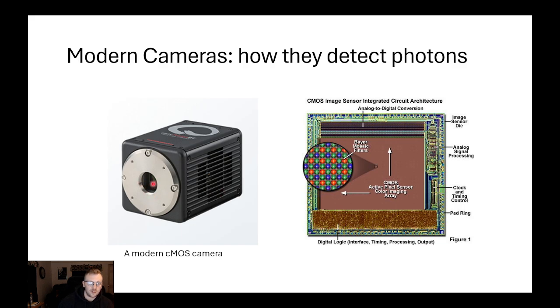So behind this opening, we have a chip. If we go over here to this cutout, this is an image representing what the chip's architecture is. There's a lot of this here that you don't need to care about. That is a computer engineering thing that we don't need to understand. You have sensors and analog signal processors, and all this stuff is designed to talk to a computer. We don't particularly care about that. We care that it talks to the computer and we're done, right?